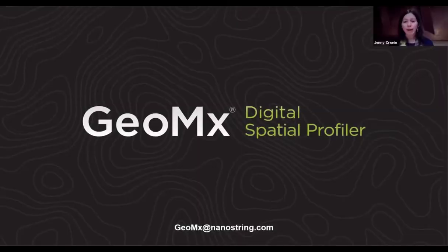Do you have any mouse neuroscience core or modules available? We currently don't have mouse neuroscience panels available for GeoMx. However, our available human content has a decent amount of cross-reactivity, and we can provide you some information on that. Additionally, we will be releasing mouse neuroscience content at the end of this year.